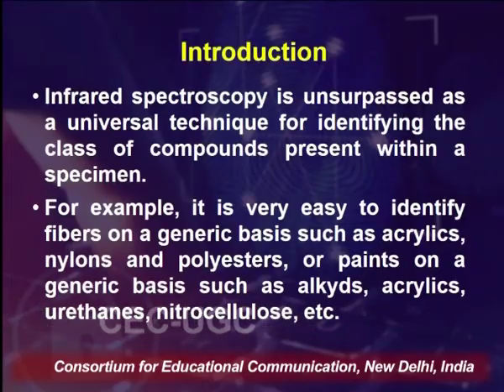the class of compounds present within a specimen. Any specimen for forensic analysis which we are using can be analyzed using IR spectroscopy. Infrared spectroscopy, in the short version, we call it IR spectroscopy.